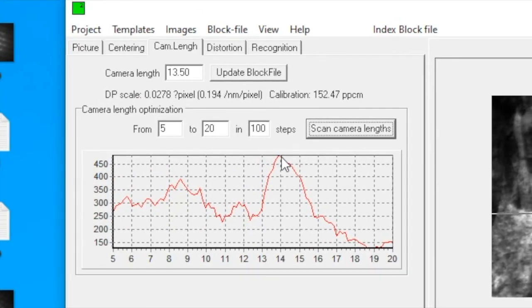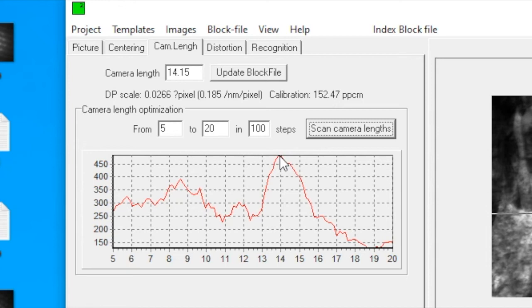Note now, by default, the camera length is 13.5. When clicking on the red curve at the highest point, it will change to a better value. The value now is 14.15. And now it's 14. We are pretty happy with 14, so we'll proceed with camera length of 14.